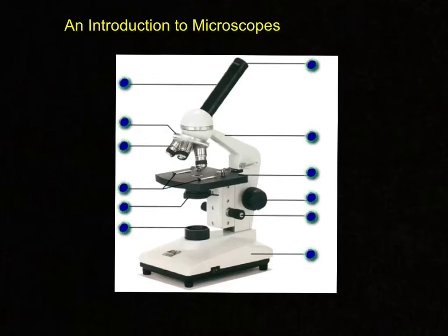As we look at specimens, we generally put them on this black counter, which is known as the stage. The stage also has these clips, known as stage clips. These clips hold the slide in place so that as we look at one particular part of a slide, we're able to find that more easily. This also allows us to show someone else something that we have observed within a specimen or a specific location within a substance. It is important to be able to communicate to others what you have seen, and so these stage clips allow for us to show and point out different features.